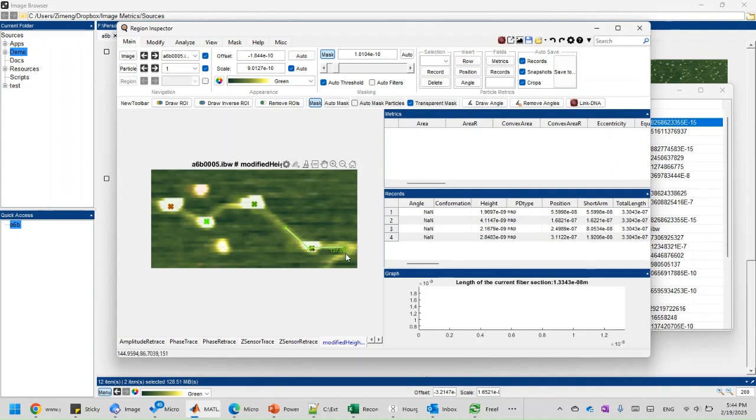We'll do the bend angle calculation once we export the table in Excel. Or you can make your own scripts here. Just let it do the calculation for you. So right now I'm content with just using this number for my angle. If you want to put the angle into one of the rows, first select the rows first.